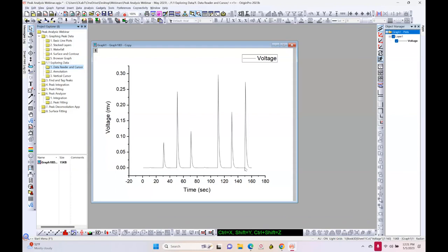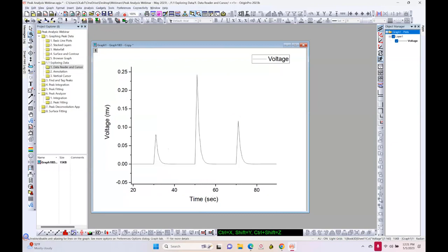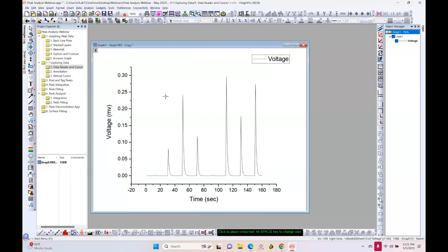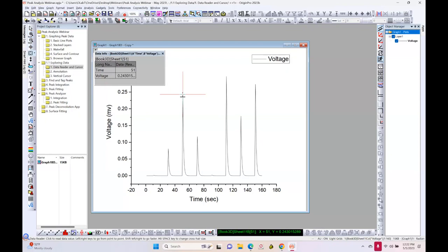Here I have some pulse data. If I just want to read some values, there are several ways to do that in Origin. When a graph is active, on the left side there is a tools toolbar with many different buttons. There's a scale-in button to zoom in and a rescale button to bring it back to the full data range. There's also a screen reader that reads X and Y coordinates wherever you click on the screen. With the data reader, the cursor locks to a data point — using left and right arrow keys, you can thumb through your data, and the data info window shows the time and voltage values.